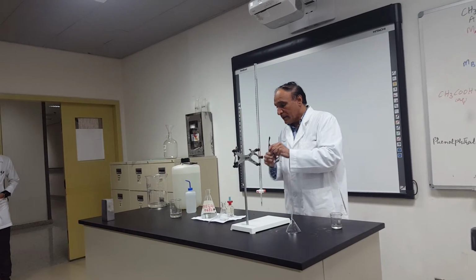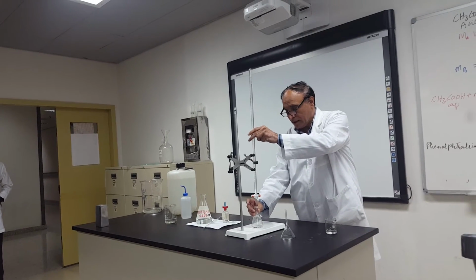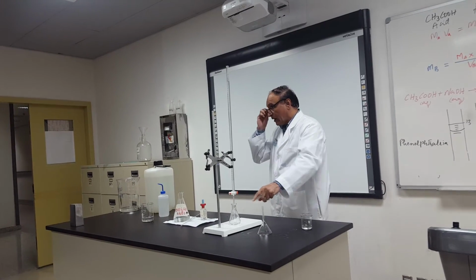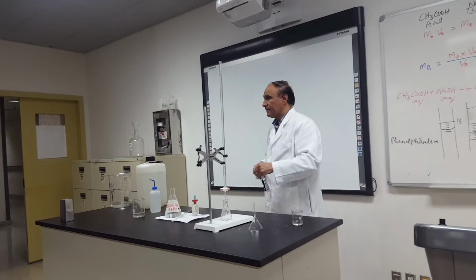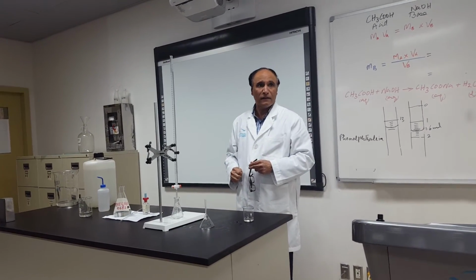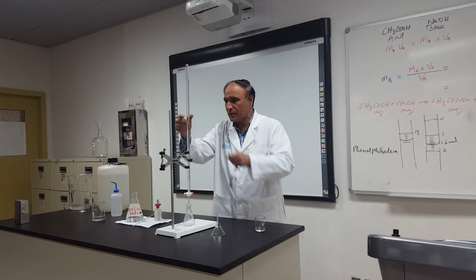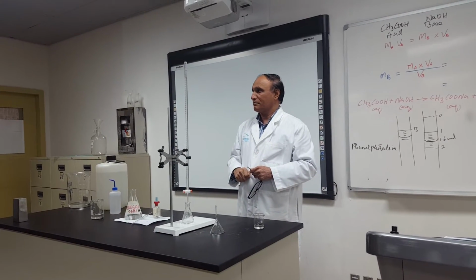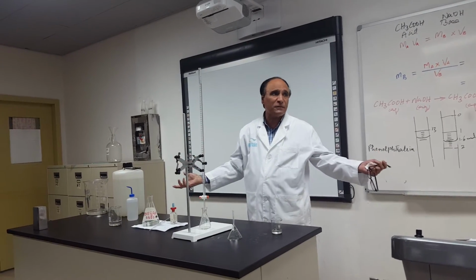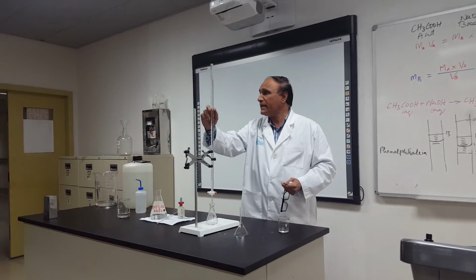Right? Now, this is ready, and I will put this sodium hydroxide in it. This is the sodium hydroxide, this is the acid. How much will I put inside? How much will I put here? 10? If I know 10, then why would I do the experiment? 1? Why not 2? How much from here to here should I put, where should I stop? We don't matter. It matters. If I already know how much I will put, then there is no need to do the experiment. There should be someone who will tell me, stop it, don't put anything more.